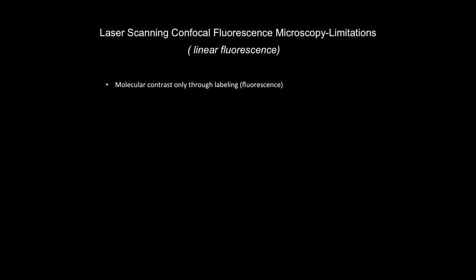And the reason for that has to do with the photo damaging, and the fact that the exogenous dyes that we add to the system that needs to be imaged can be excited more efficiently than the endogenous dyes.